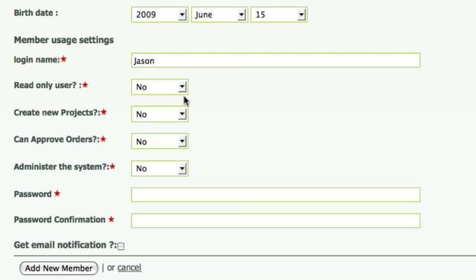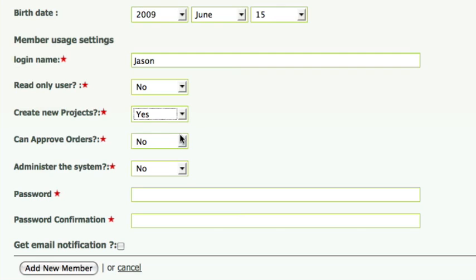Create new projects. I'll say yes. Jason is part of the lab and he needs to have the option to describe what he is doing in his project.